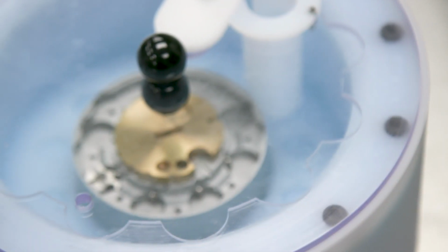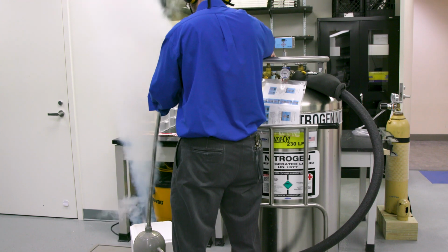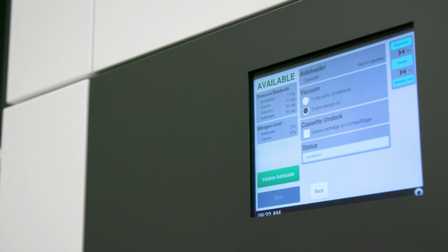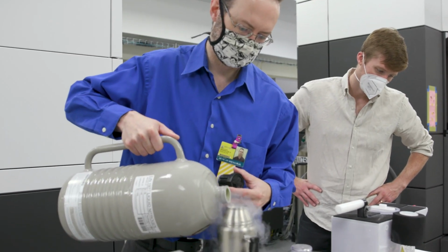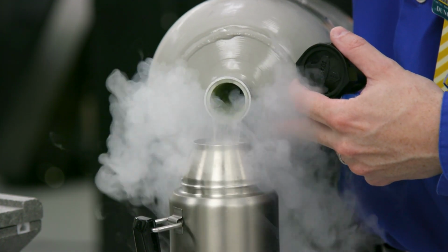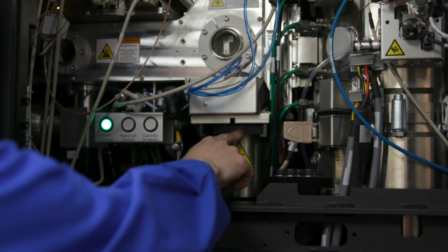Cryo-electron microscopy blends two components. Cryo basically means we're working at very, very cold temperatures, in this case at or below liquid nitrogen temperatures. We do that to preserve biological specimens so that they're not damaged when they're put into the microscope and imaged. The microscope itself works very similar in many ways to a light microscope, except that it uses electrons instead of photons to image samples. So CryoEM basically is the merging of an electron microscope with cryo to preserve biological specimens.